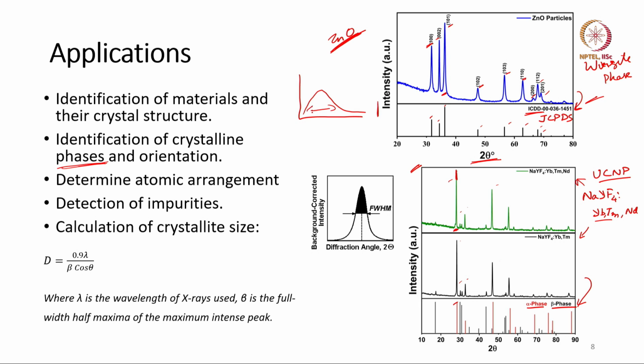So the peak that you have in X-ray is really broad in nature, so that determines the amount of crystallinity, or you could comment on the amount of amorphosity present in the sample. Our polymers are usually amorphous, so you get a broad peak, while from the nanomaterial that you synthesize, you get some sharp peaks but they are still broad.